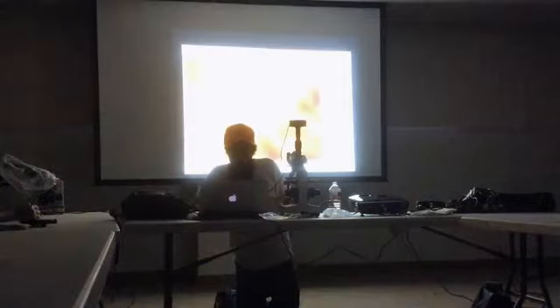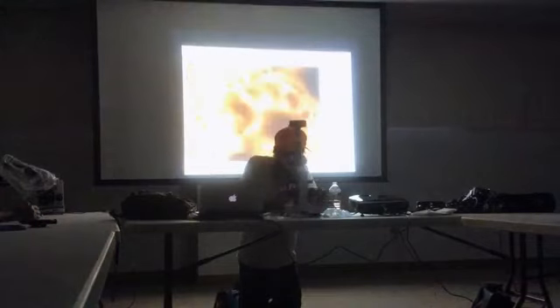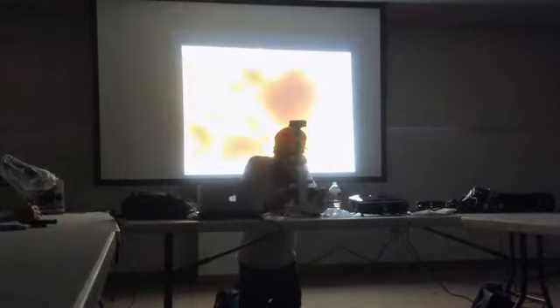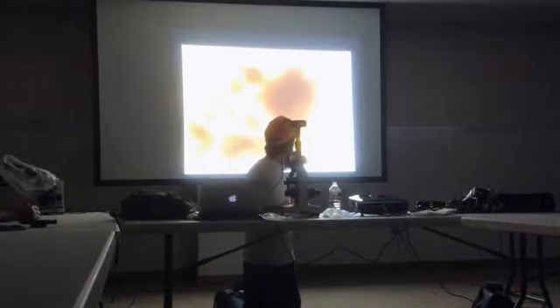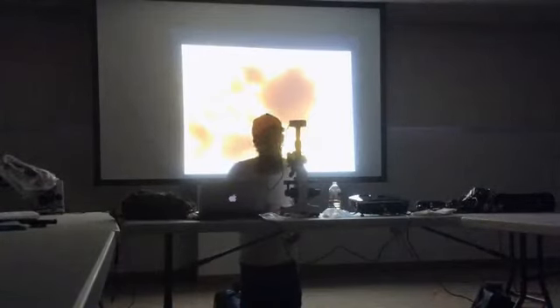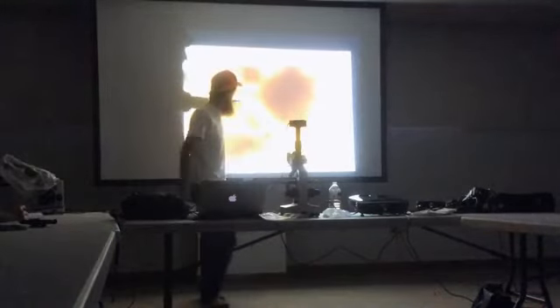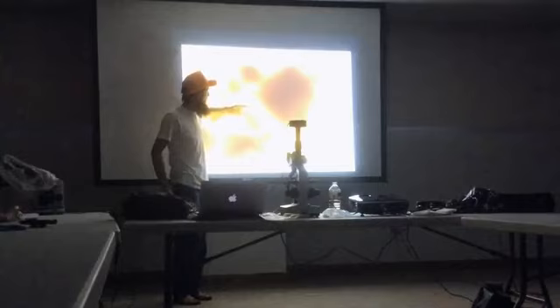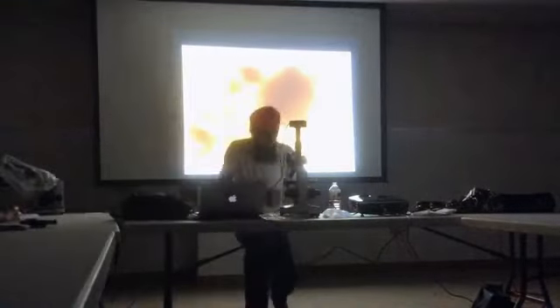So I'm trying to balance this for a minute. So what is that? Yeast? Yeast. Yeah, it's a yeast, right? You see how it's budded? It is budding. They're budding on each other. These two, those are yeast right there, and then that might be the fungus.